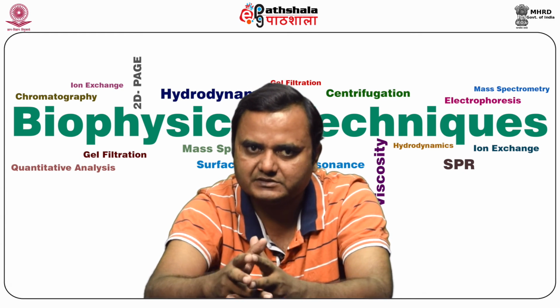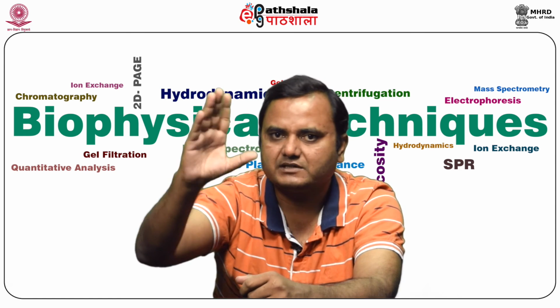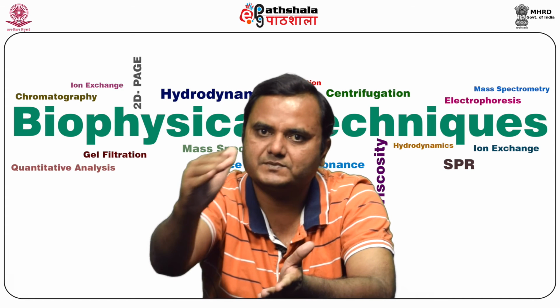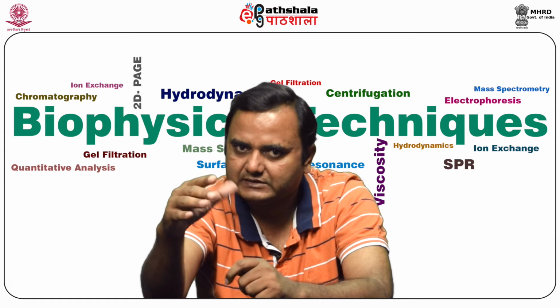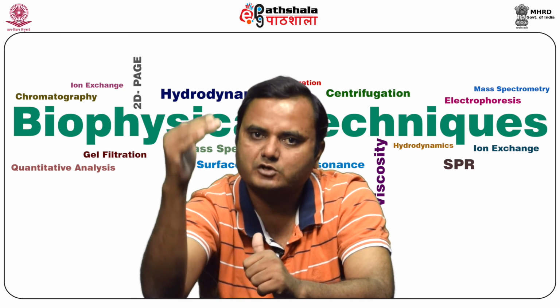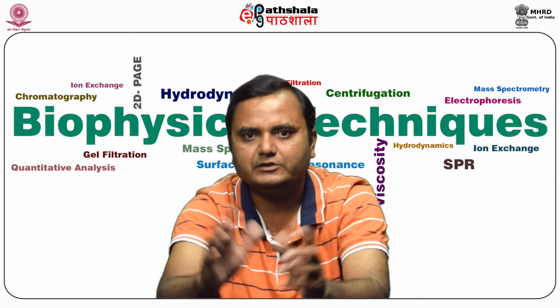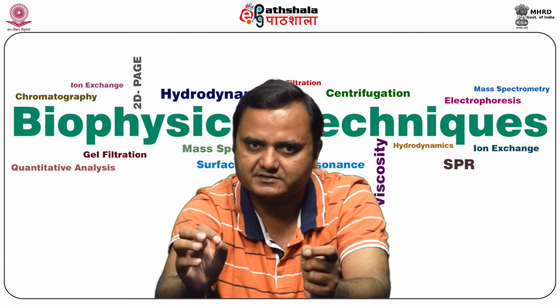While the centrifugation process goes on, once the particle starts moving as per the law of Stokes equation and reaches its isopycnic position, meaning the position with similar density, then it stops moving because there are no more forces acting on it. The separation velocity becomes zero. So the particle stops at that position, and that is the factor taken into account for the separation of particles with differences in their densities during the isopycnic centrifugation process.